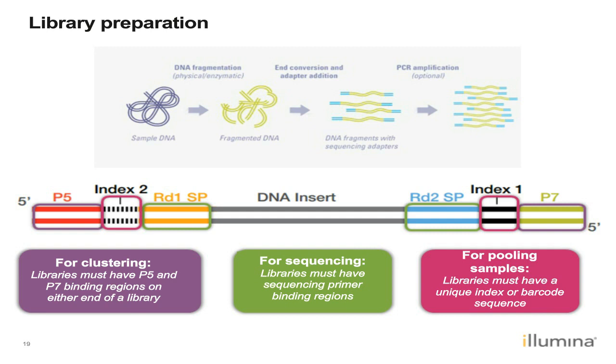The sequencing primer binding sites, which touch the DNA insert, are required for us to generate data from the libraries. The index sequences allow us to identify which data are from each sample that we sequence. The index sequence for each library must be unique, and these sequences will be read during the sequencing run. We may have additional steps like cDNA synthesis for RNA-seq libraries or targeting steps if we're preparing amplicon or enrichment libraries. If you are using an Illumina library preparation kit, the libraries you prepare will have all of the necessary adapter sequences and will be compatible with Illumina sequencers.